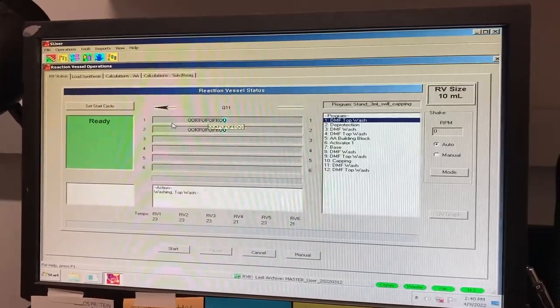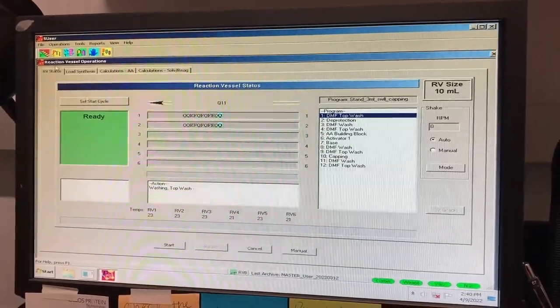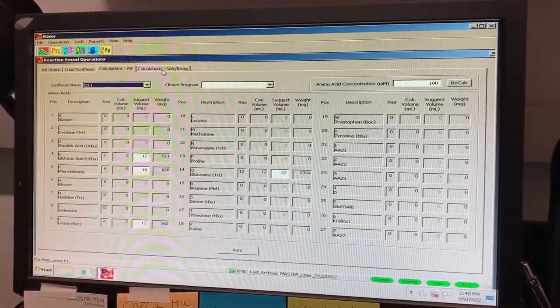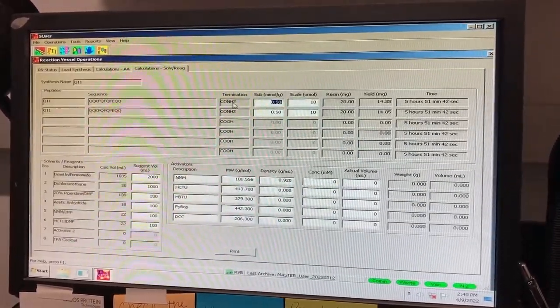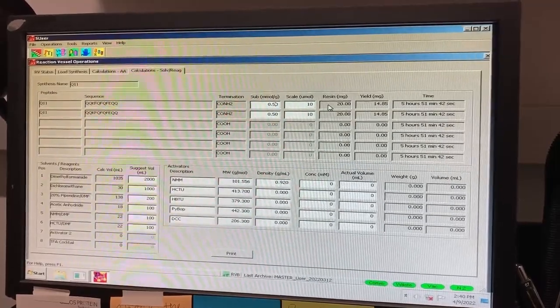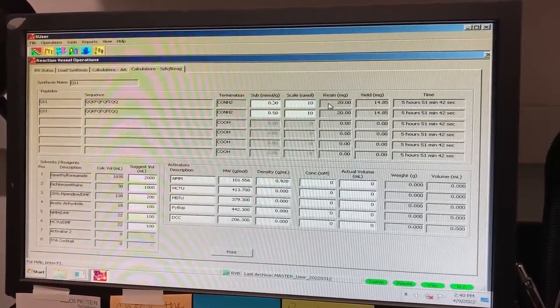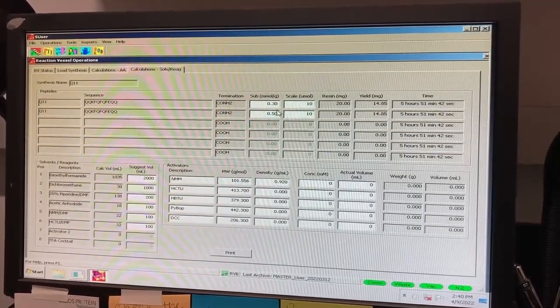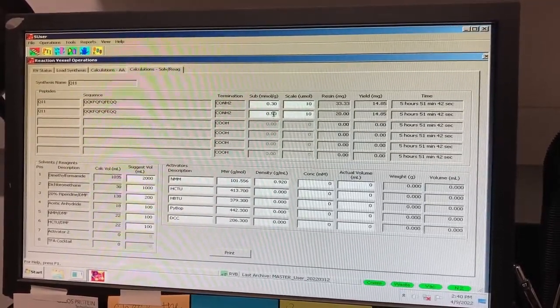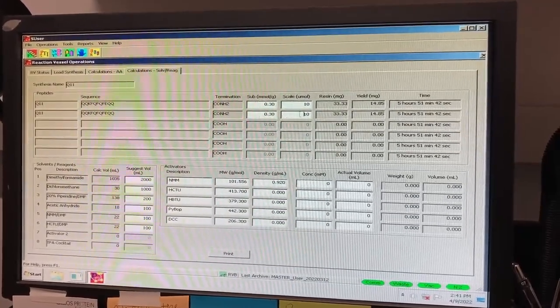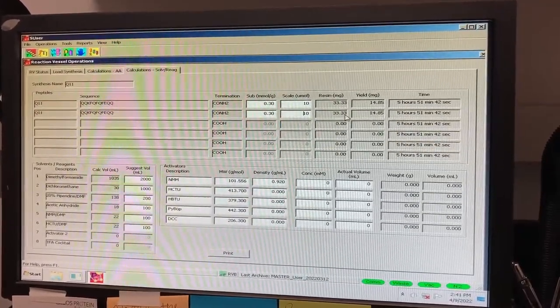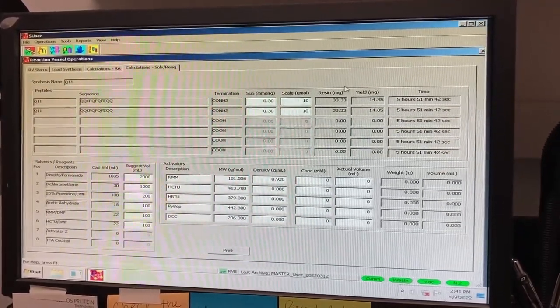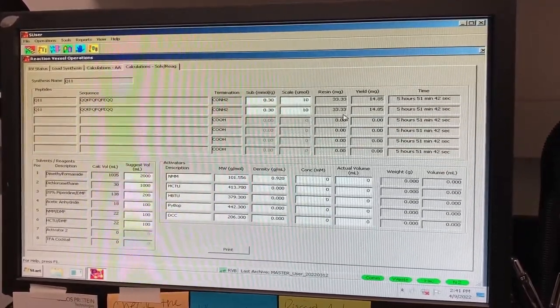Under the Calculation Solvent Reagent tab, you will want to change the sub-column to 0.30. You will need to hit Enter or click away for this change to register. Your resin weight should now read 33.33 milligrams. This is the amount of resin you will need to weigh out in the reaction vessels.